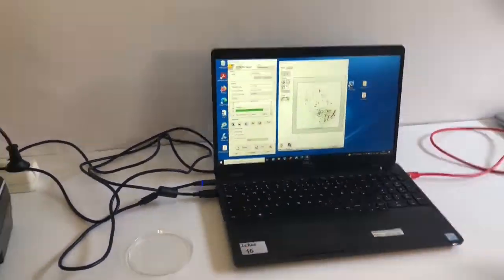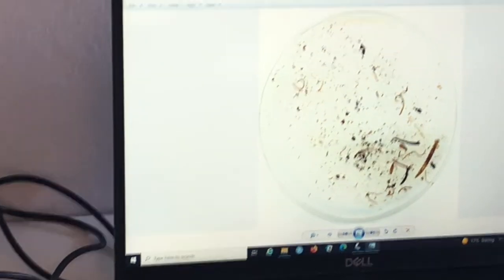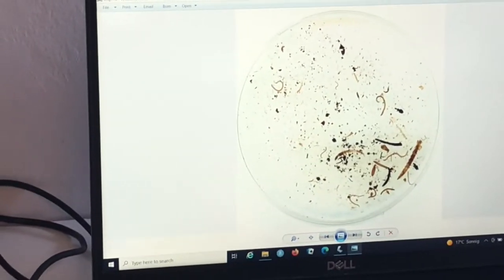Scanning process takes a couple of minutes and during this time next sample can be prepared. The file will be saved to the associated folder.